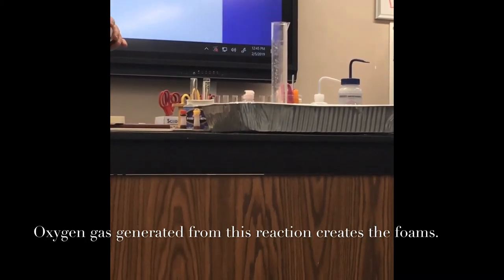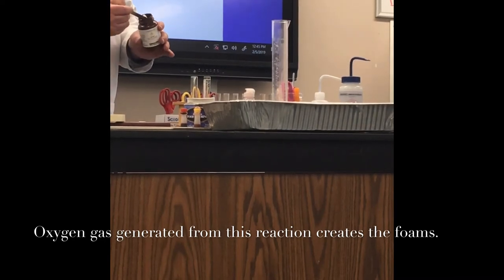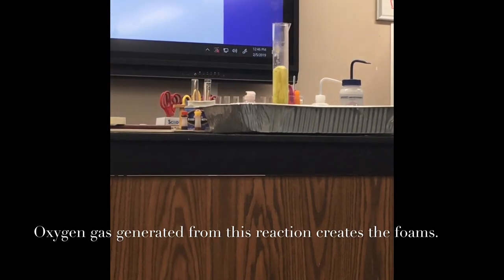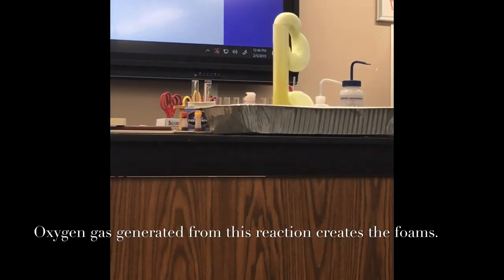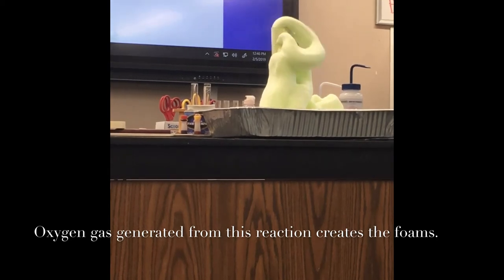Did you already put the hydrogen peroxide in there? Yes. This is the first one. Here we go. Oh, what the heck? Whoa. Extremely hot. Exo or endo? Exo.